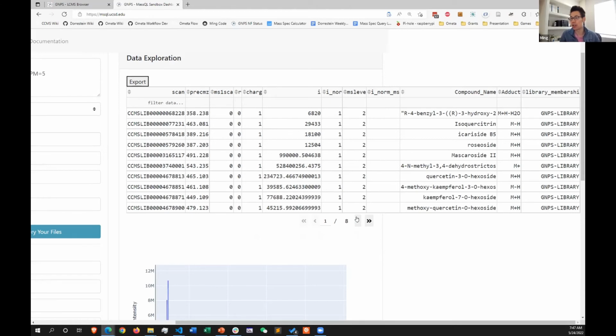And so one of the applications that we uniquely are enabling is, imagine, before we were taking all this public raw mass spec data and asking, hey, have we seen this molecule in there before? Well, that's searching for that particular molecule, but we can broaden the scope a little bit, right? What if we wanted to find all glycan-containing molecules across all public mass spec data and then visualize the chemical diversity in the molecular network? You can do that today.